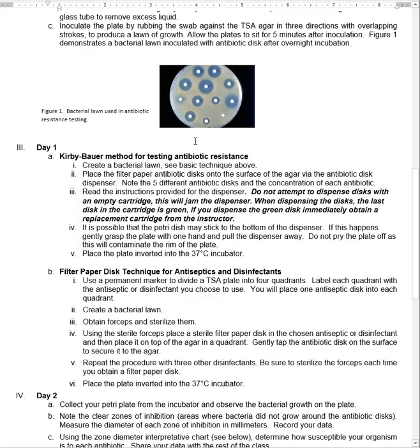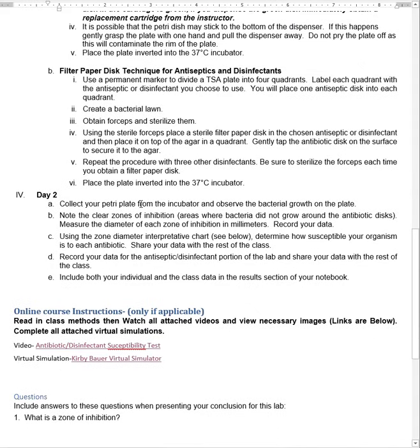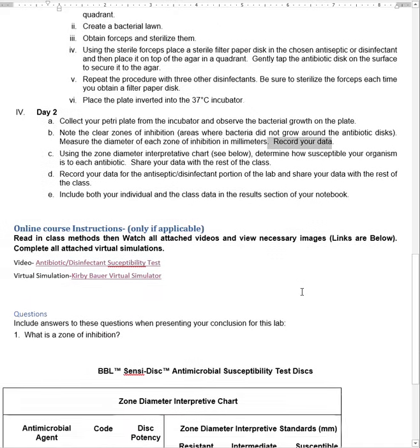But we have to press them kind of gently into the agar, because remember, we're going to be turning this upside down. So when we come back, we take these out, we look at our growth, we're going to measure the millimeters, and this is something you would record. And then we'd use the zone standard chart to tell us.